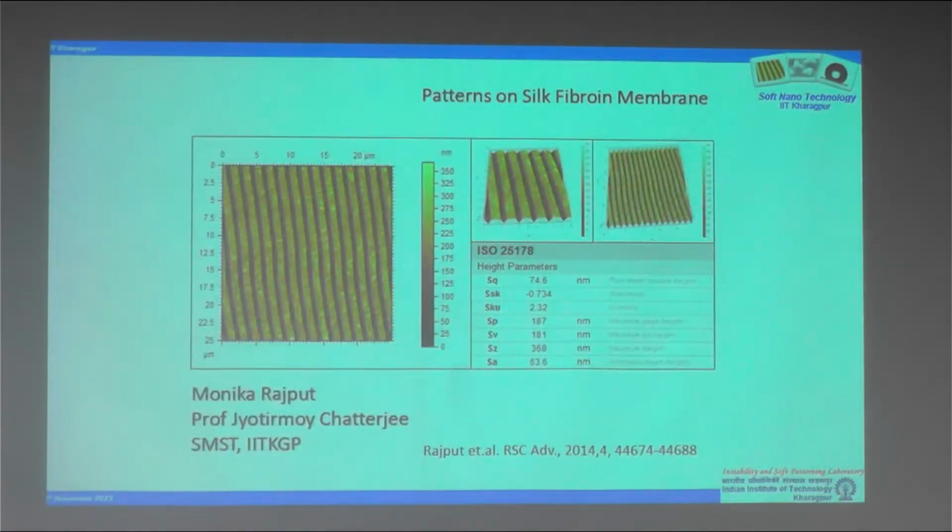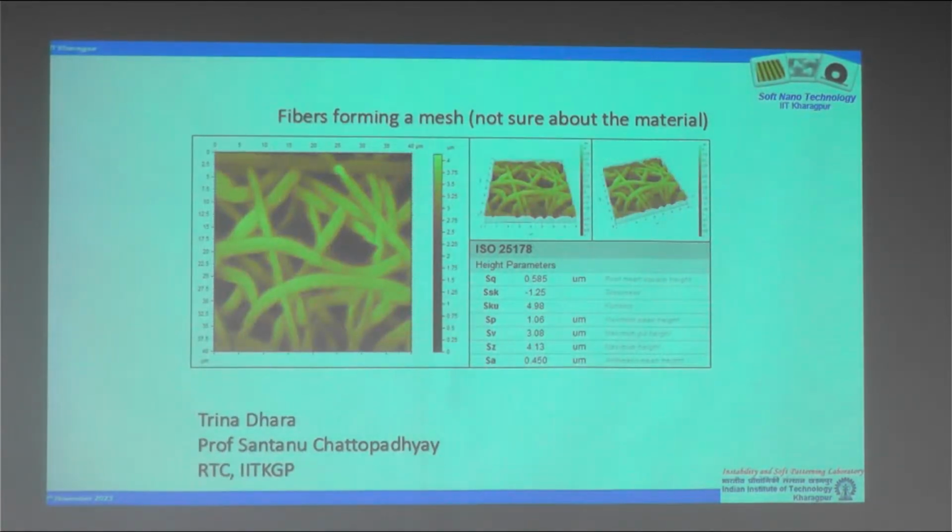So all these I will skip, but here are some nice images I would like all of you to enjoy. These are some fibers, for example, the AFM images. All right, so some mesh that has happened.